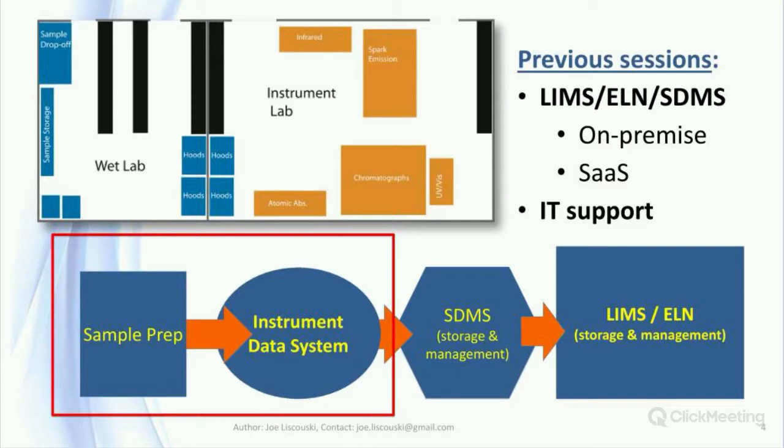During the previous session, we covered a lot of ground around the lab system support issue. One point that was noted earlier in that webinar is that much of what has been covered so far doesn't require much education beyond a high level of competence in computer systems and an understanding of modern database technologies to support lab operations. That's going to change in this presentation as we move towards the generation of laboratory data and information through instrument data systems and sample preparation.